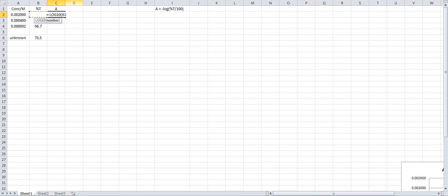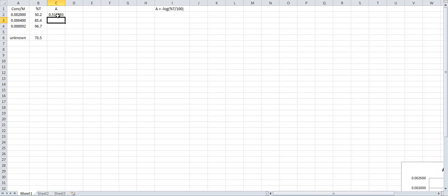Just click it, slash, 100, close parenthesis, and you hit enter and you'll see your absorbance is entered in the line.